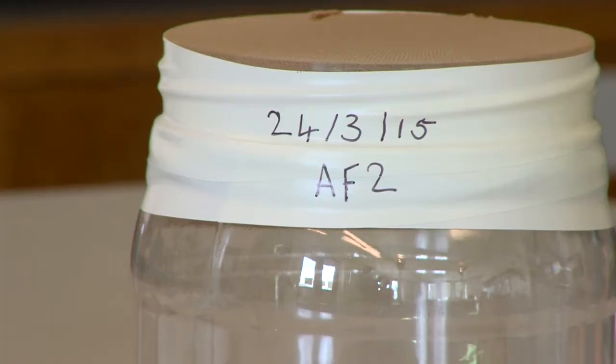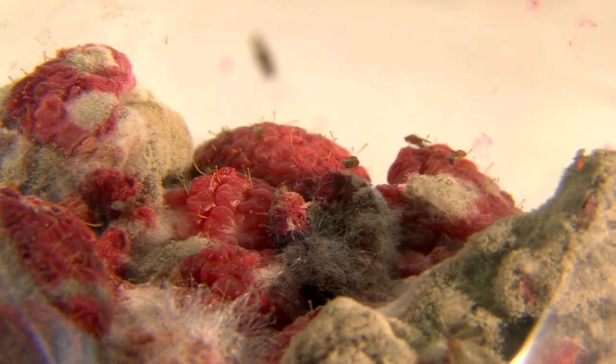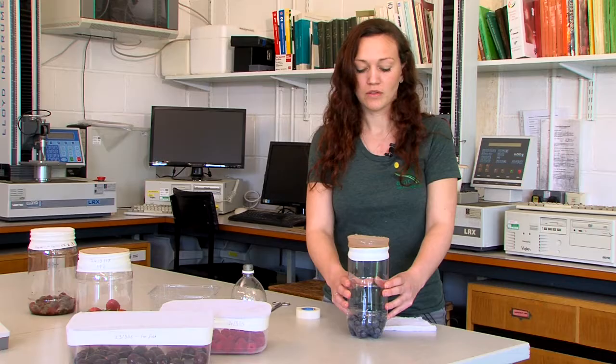This should then be labelled with the date the fruit was collected and a reference to where the fruit came from. We then store this for three weeks in a warm place and check regularly for emergence. This then reassures you that your crop protection methods are working and your fruit is free from SWD.